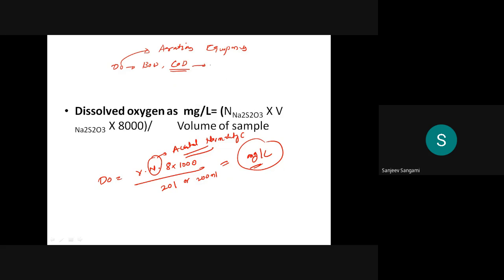It is also interlinked with the pH. We have discussed how exactly we are going to do this experiment. The experiment we are doing is Winkler's method of determination.